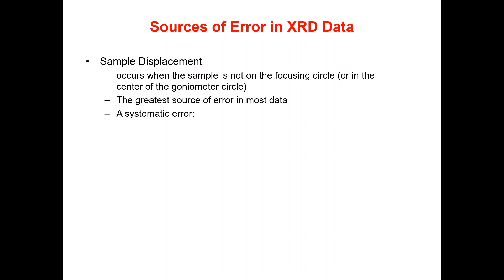We will discuss each type of error one by one and then suggest possible solutions for the reported errors in the data. The first type of error in XRD data is called sample displacement. Sample displacement occurs when the sample is not on the focusing circle, which we discussed in our previous lecture.